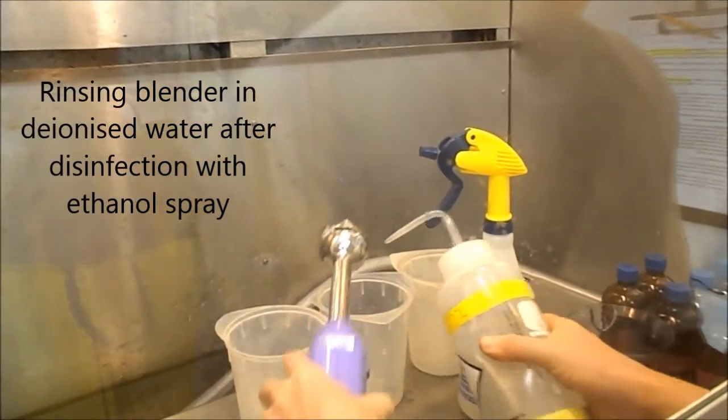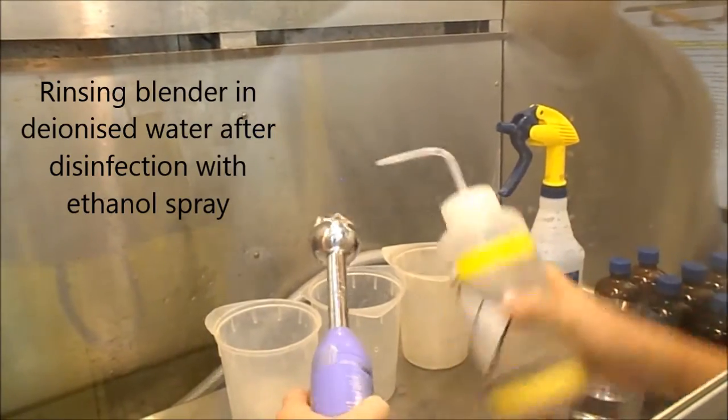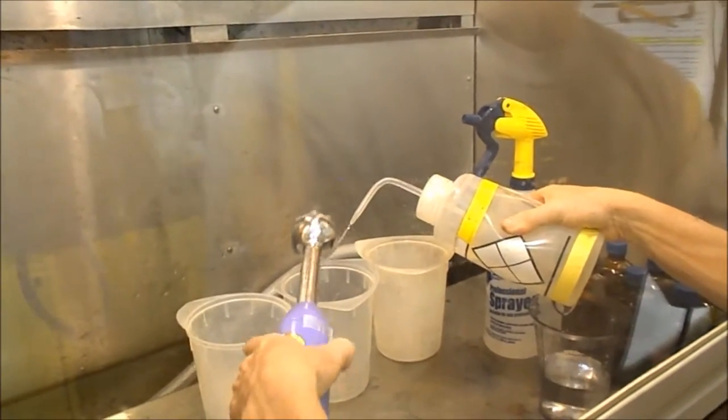So you rinse it now with? With DI. DI and then with the alcohol. Yep, I stick the alcohol first, now I'm rinsing the alcohol.